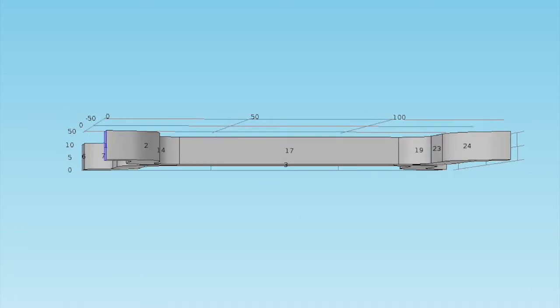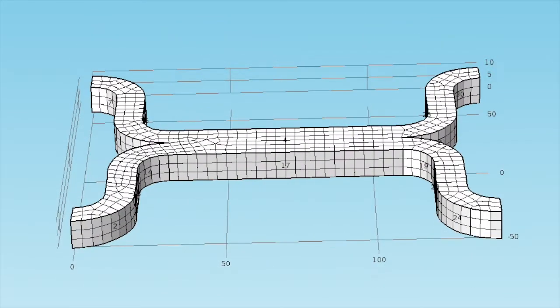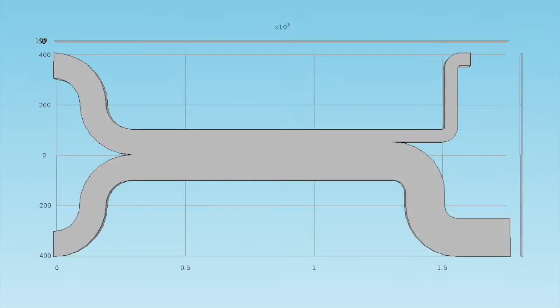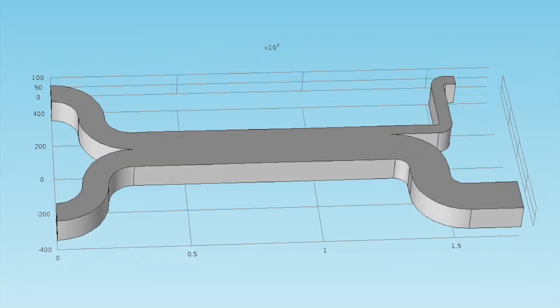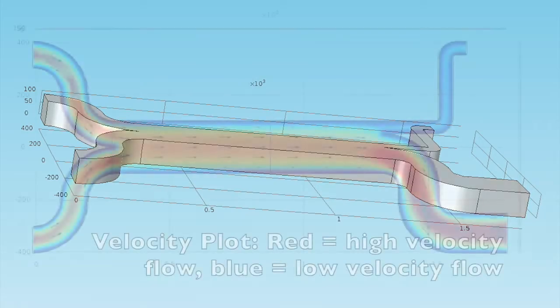Our original designs were dimensioned with a channel cross-section of 100 micrometers squared for the inlet valves, each with an inlet flow of 15 picoliters per minute, and 200 micrometers squared for the diffusion chamber. Our final design increased the dimensions to 10,000 micrometers squared and 20,000 micrometers squared respectively, with a smaller outlet valve for the buffer bacteria solution.